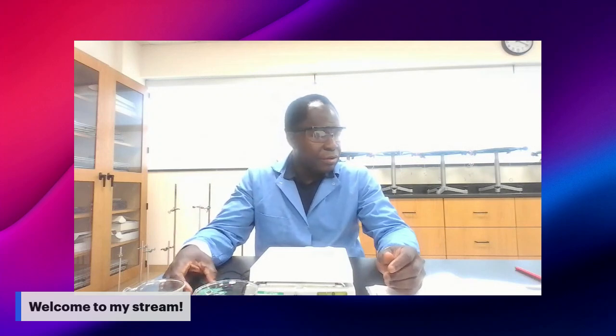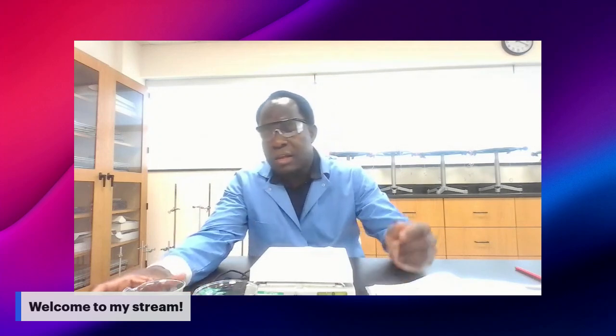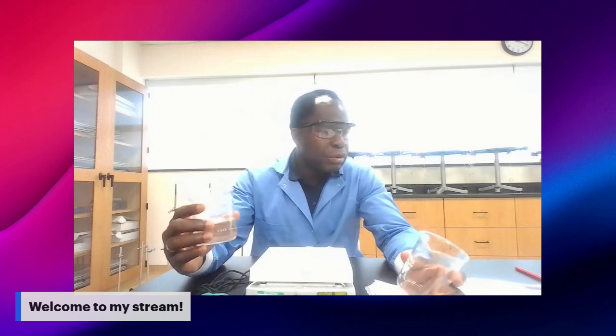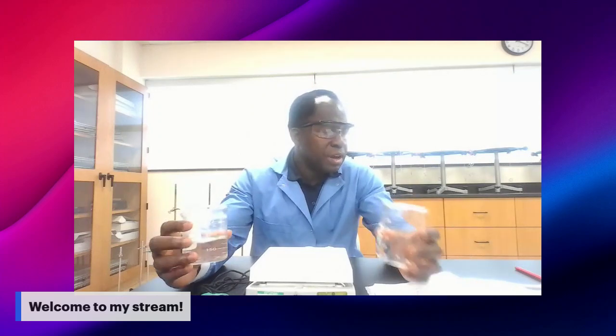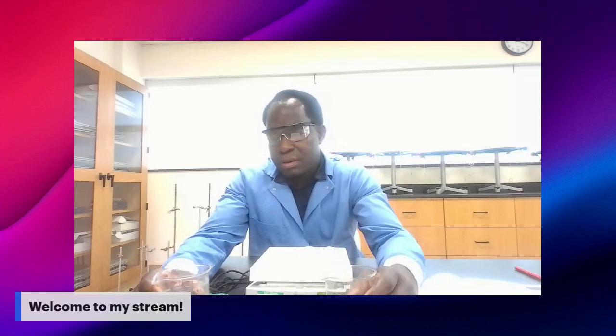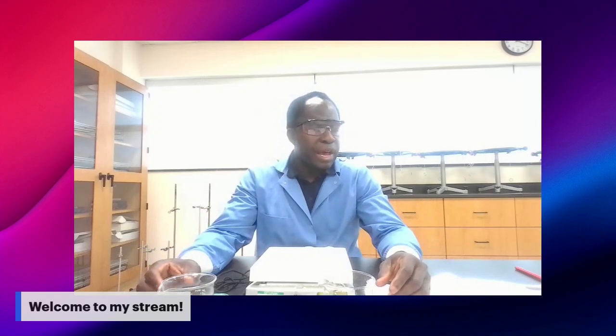Okay, you need 200 milliliter beakers. Okay, you need two of them. As we move throughout the procedure of this lab, you're going to know why we have two. Okay, you need 200 milliliter beakers.